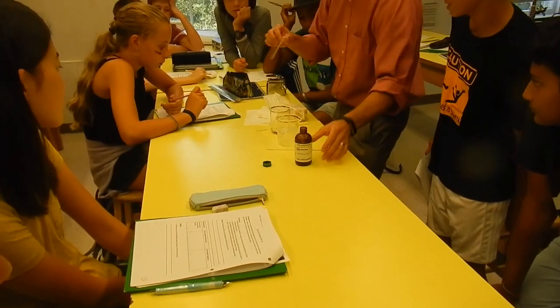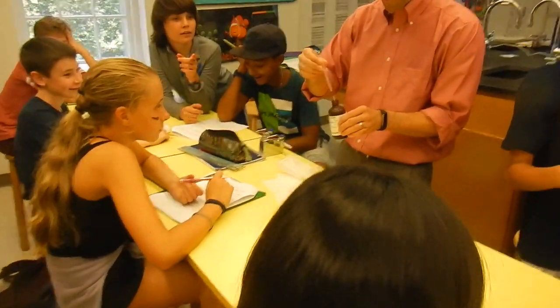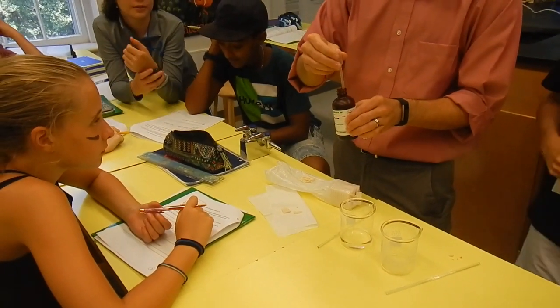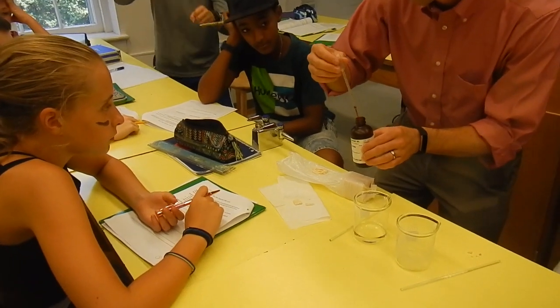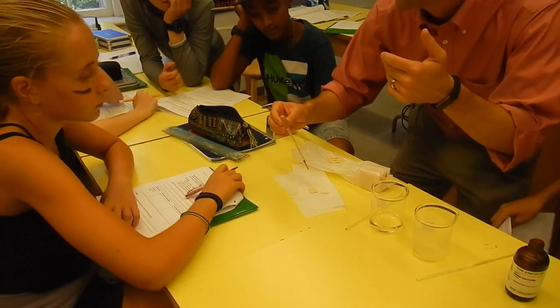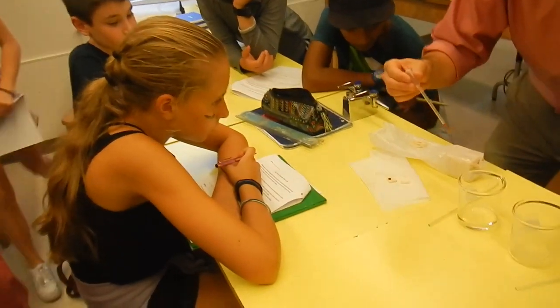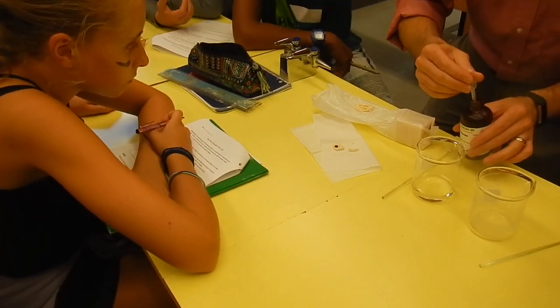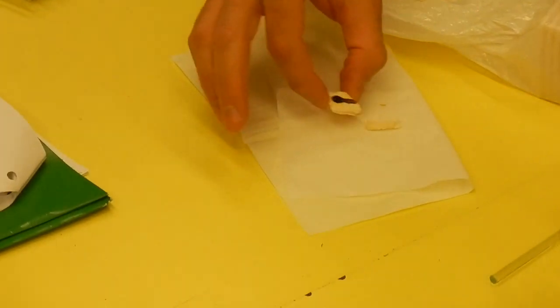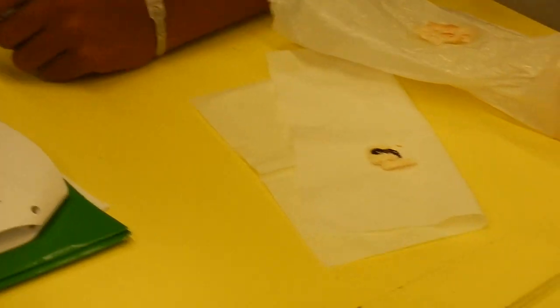If I put iodine on starch, do you know what happens? It turns blue. Oh yeah, that's true. It says it right here. I was out camping, and I had iodine water, and I washed my bowl that had oatmeal in it, and it turned blue. Do you guys want to come closer? You can put iodine on. This is officially a dark blue. Oh yeah, it is. The one that's on the cracker, it's officially a dark blue.